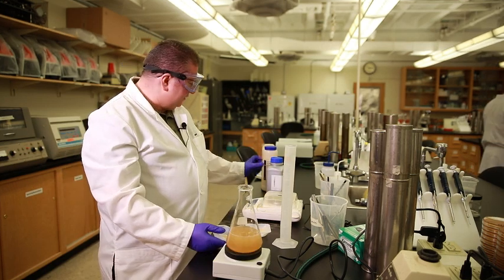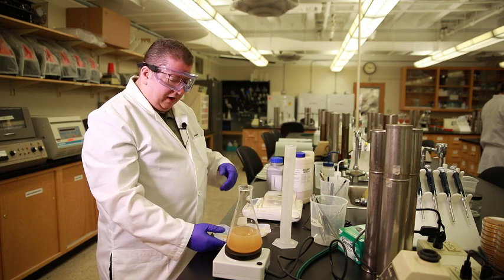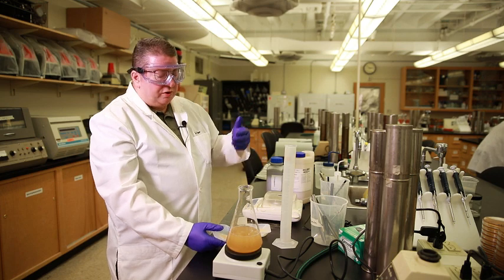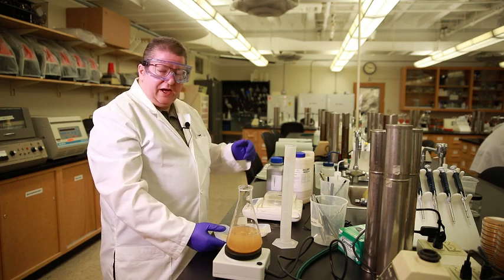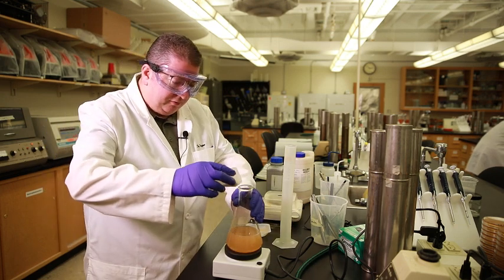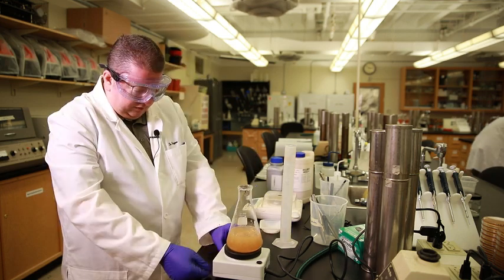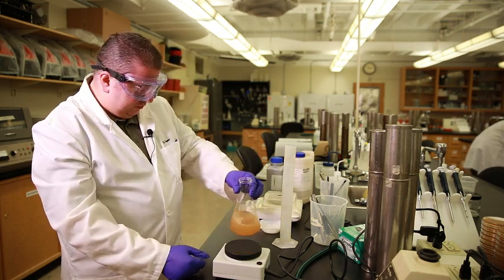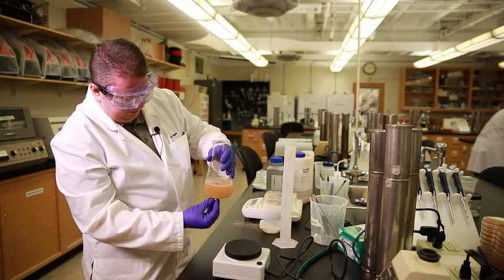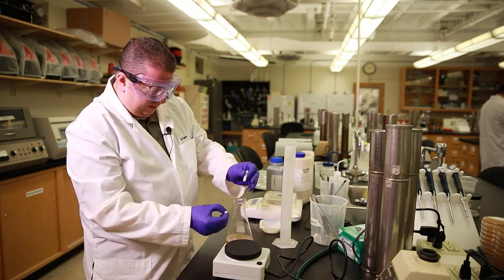And what's in this is a combination of yeast extract and meat extract. Essentially, it has ground up dehydrated yeast cells that have sugars, proteins, amino acids, fats, vitamins, everything that a microorganism would need to grow. Okay? So now what I'm going to do is add in my agar and let that mix. And that should be enough mixing. So now I need to retrieve my stir bar. I use another stir bar to pull it up and pull that out.